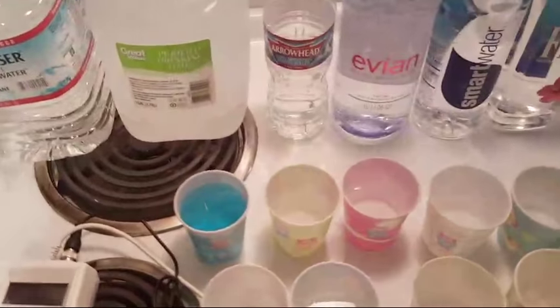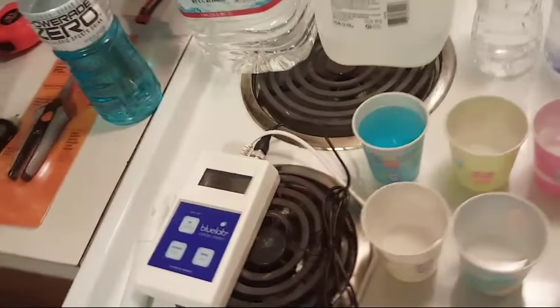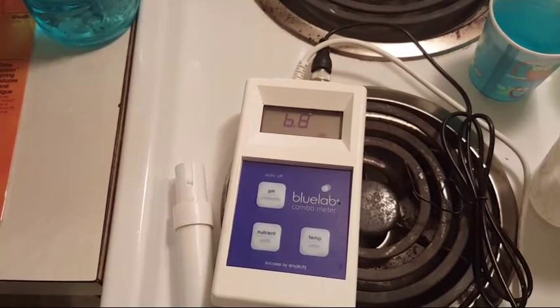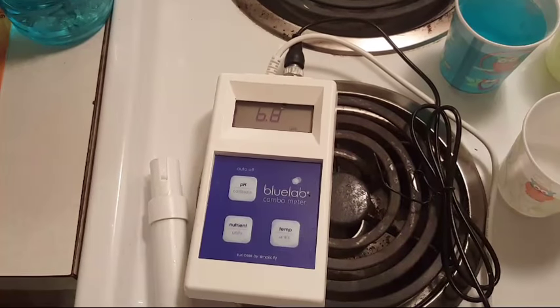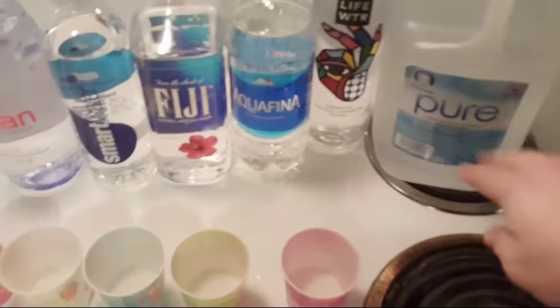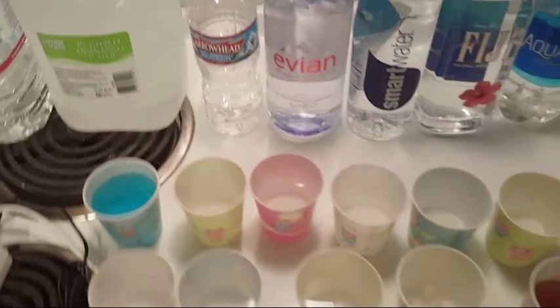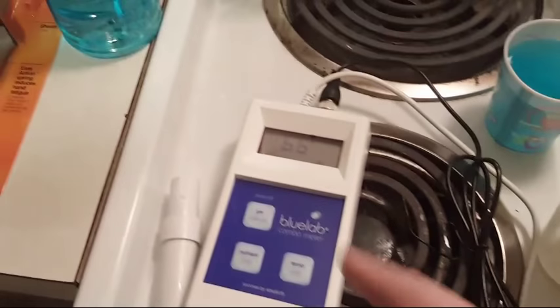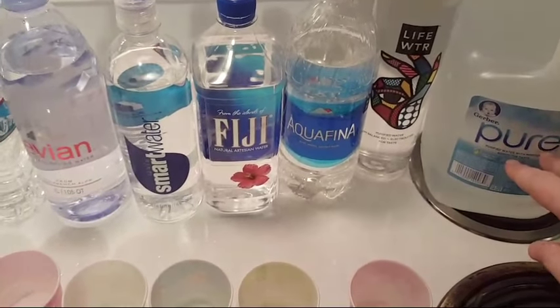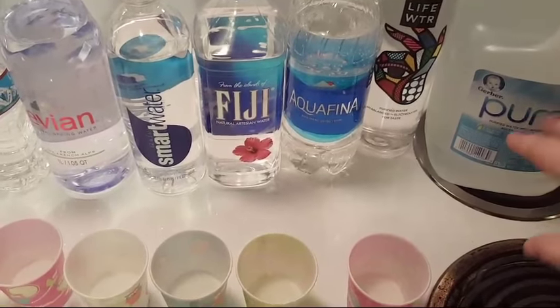Nestle Pure Life looks like it might have a decent pH and I know it has some good stuff in it, but it's already dropping to 6.9 — and my battery's probably going to die any moment. There it goes: 6.7. Nestle Pure Life is out. So the winners are: Gerber Pure, Fiji, Evian, Arrowhead, and Crystal Geyser. Everything else — don't drink it. The meter is already down to 6.6 for Nestle Pure Life — that's bad. Gerber Pure has around 180 PPMs, meaning a lot of good stuff in it.